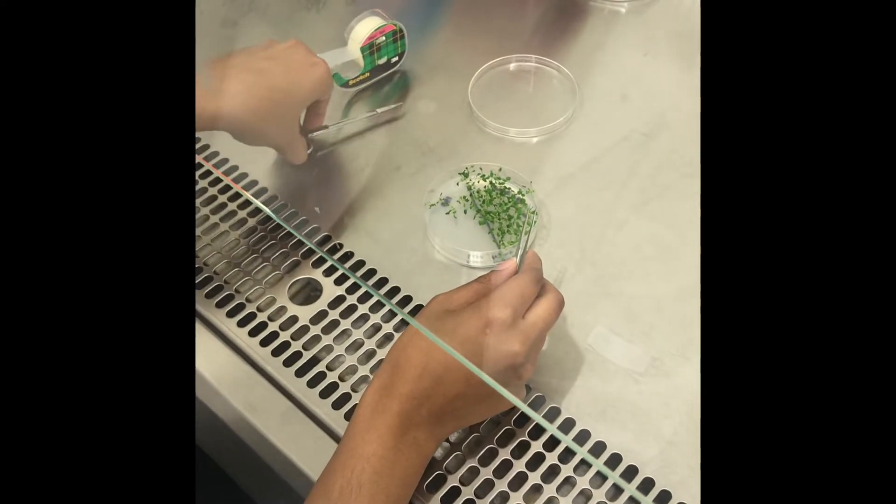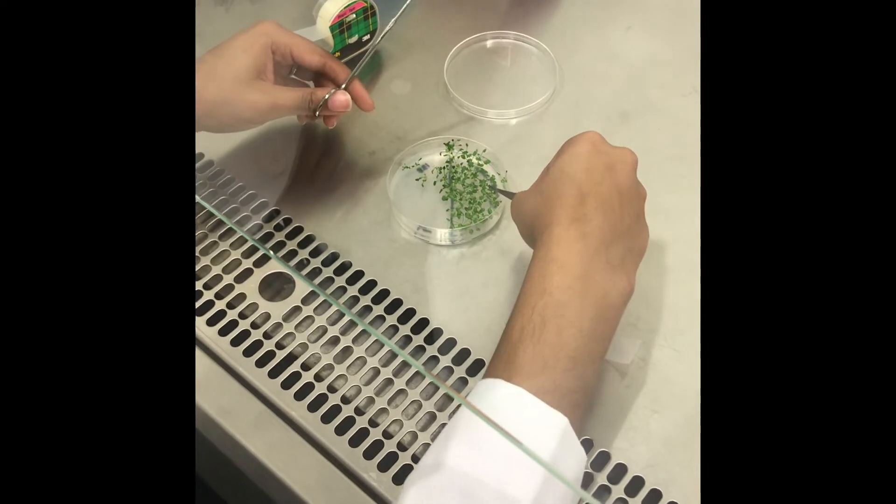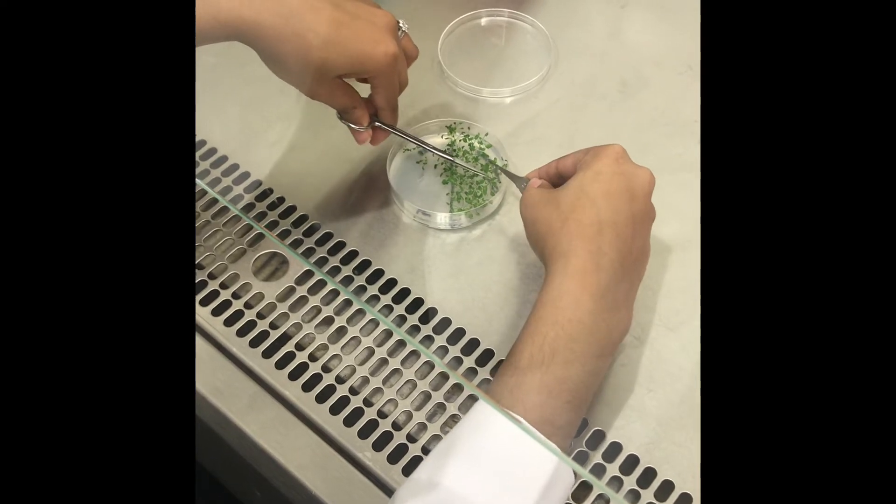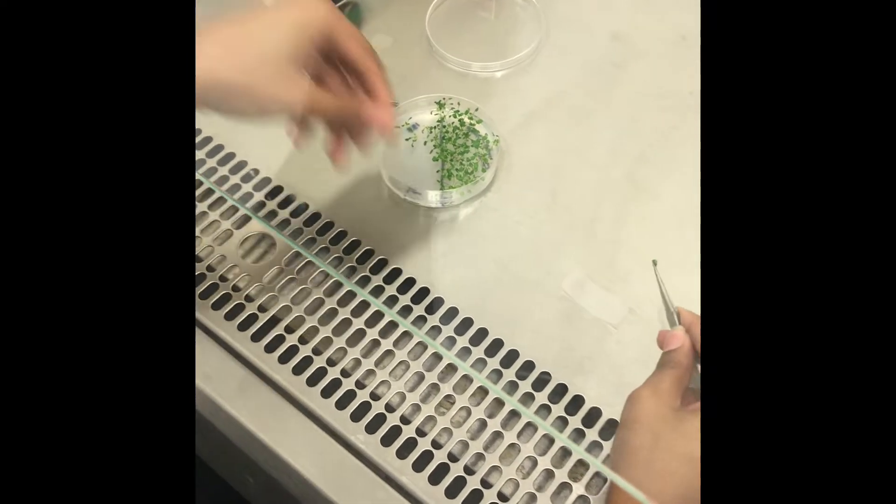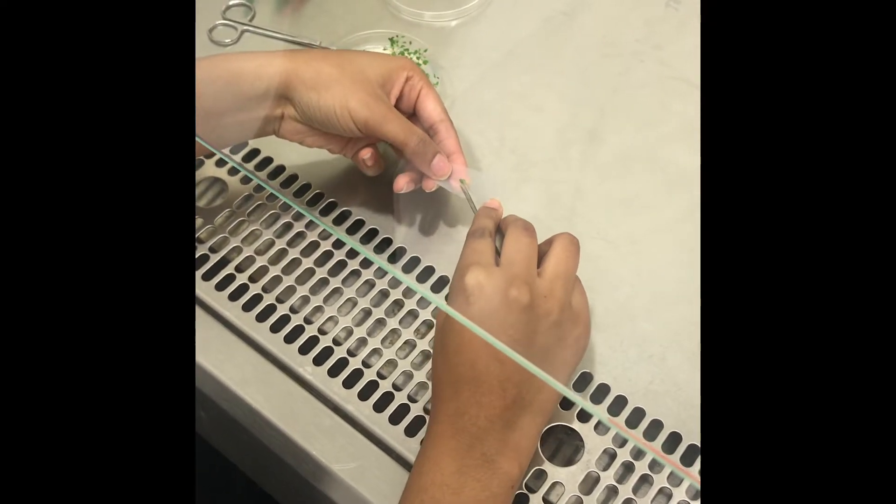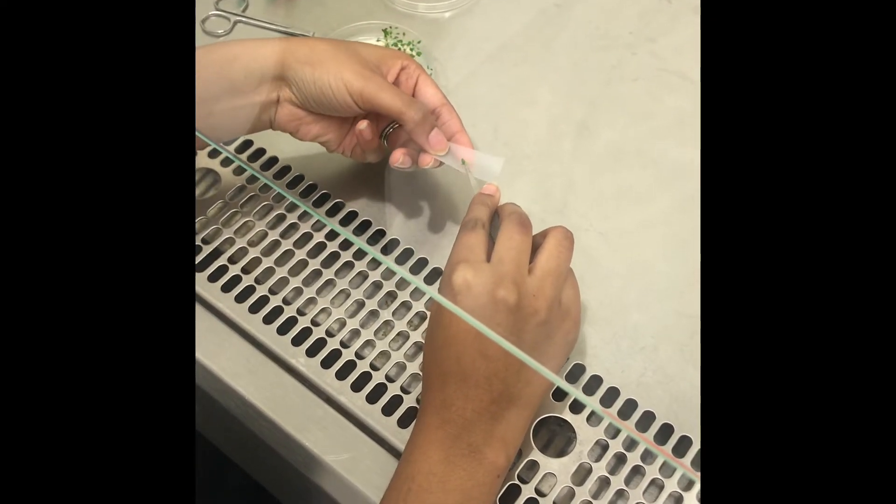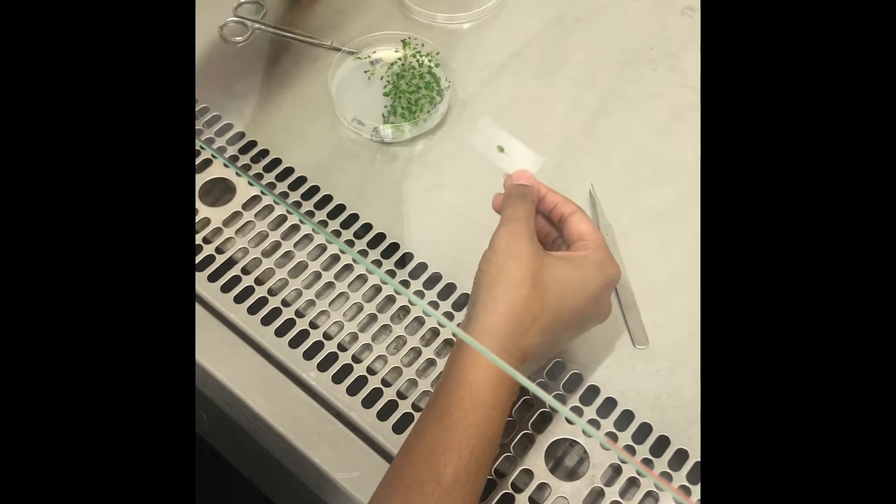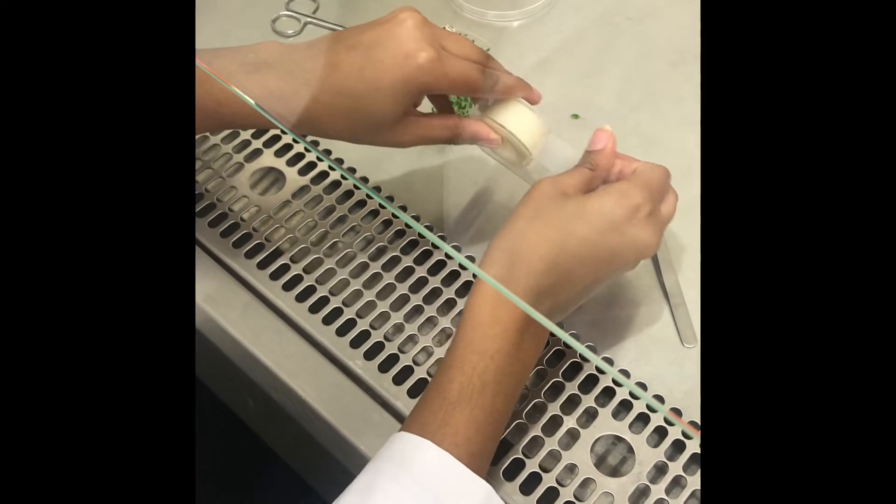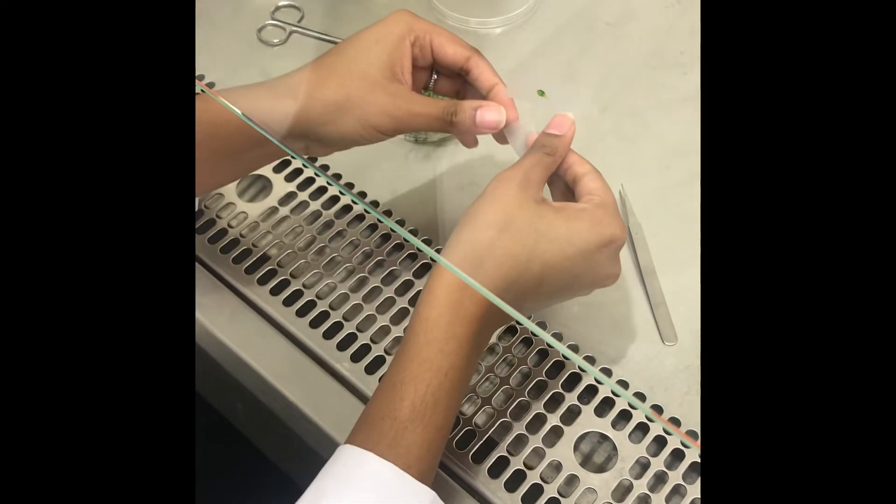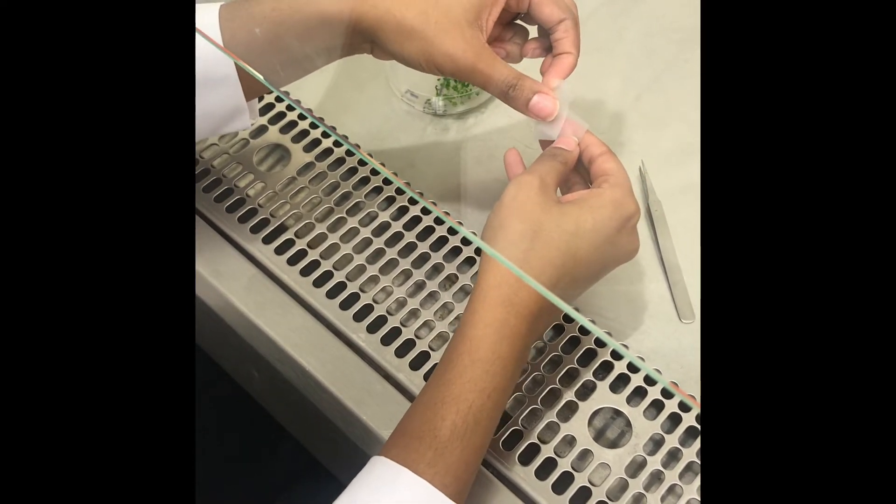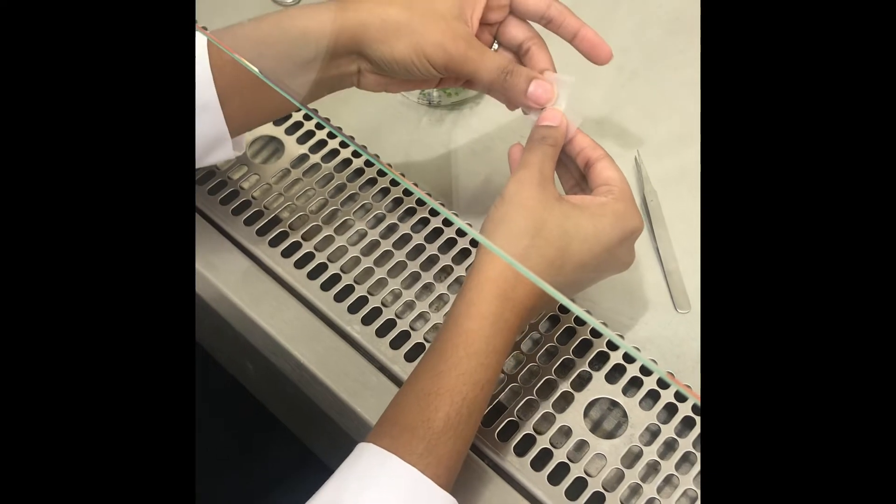So now I'm just going to take a leaf from this petri dish and place it on a piece of scotch magic tape. Now I will take a second piece of tape and place it diagonally across my first piece of tape and I will gently rub it.